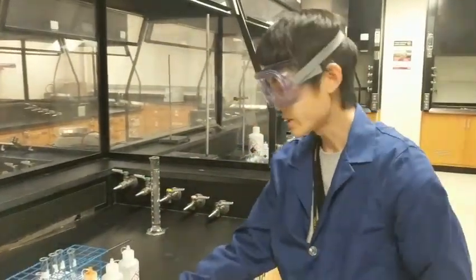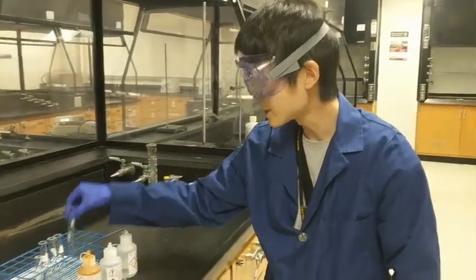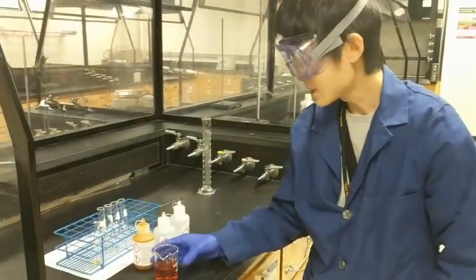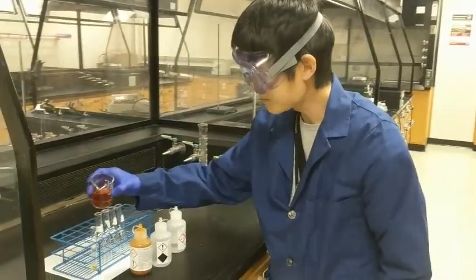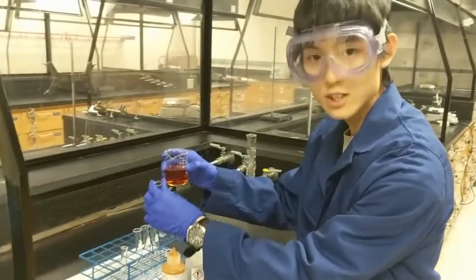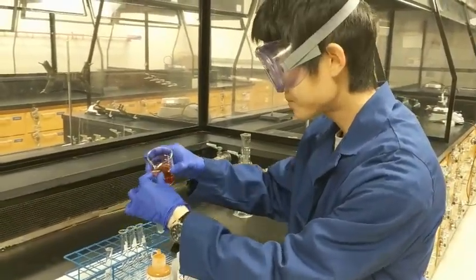So next, we are going to split this solution into 4 different clean glass test tubes. You don't have to use all of the solution. Just fill around half the volume of each test tube.